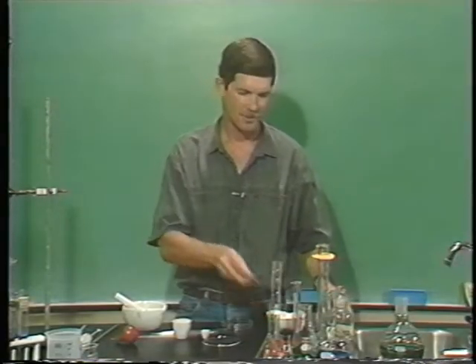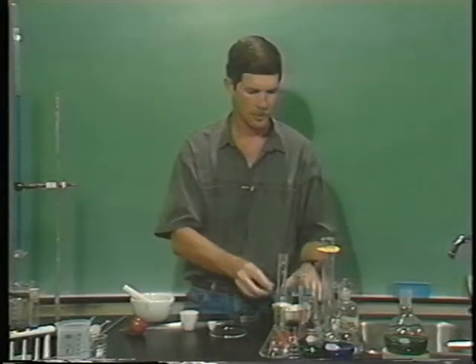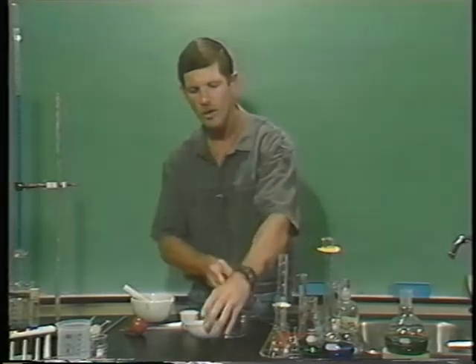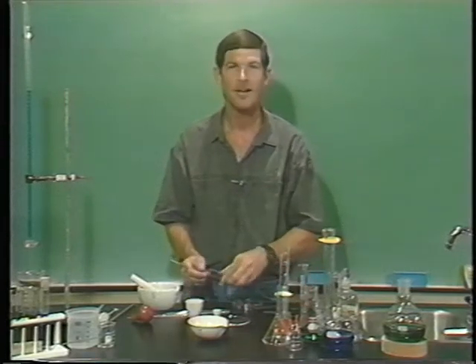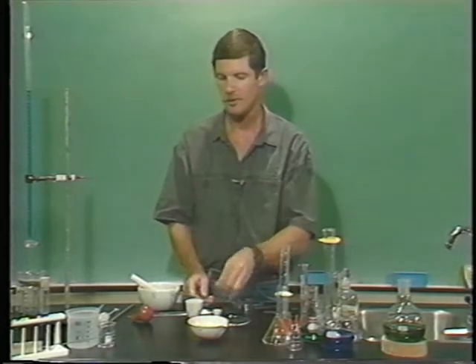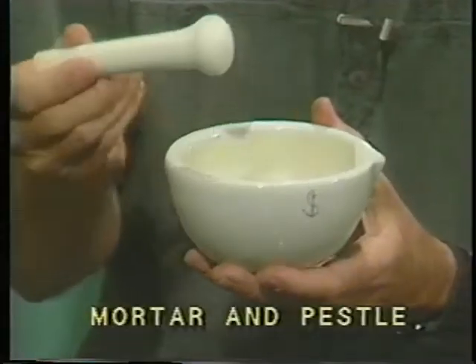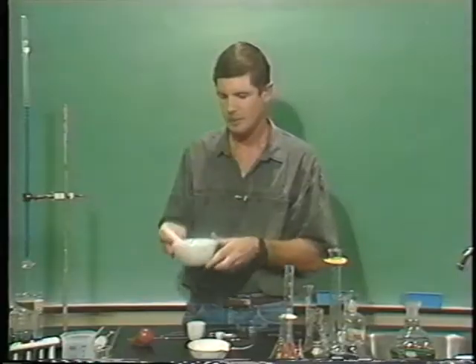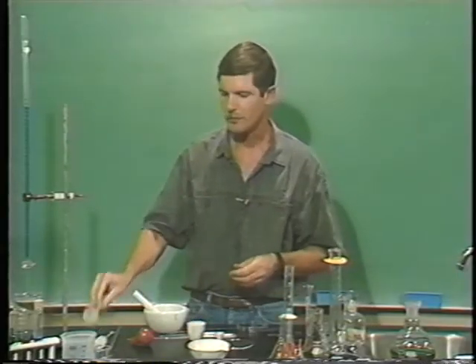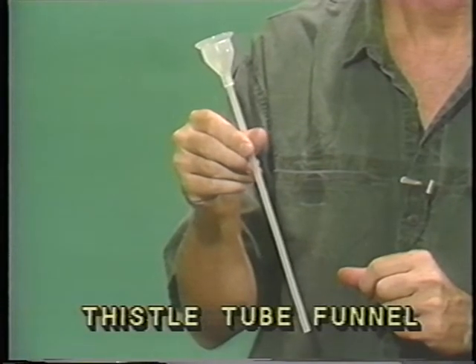Then we have these things. You've seen these before. We don't call them eyedroppers, but just droppers. This dish over here is called an evaporating dish, and this one's made out of porcelain. Then we have our glass tubes and our glass stirring rods, like the one we used in the last experiment. This is called a mortar and pestle. This is the pestle and this is the mortar, and it's used to grind up chemicals. Next, I see a special type of funnel. It's called a thistle tube funnel. It's a regular funnel with a very long tube on it.